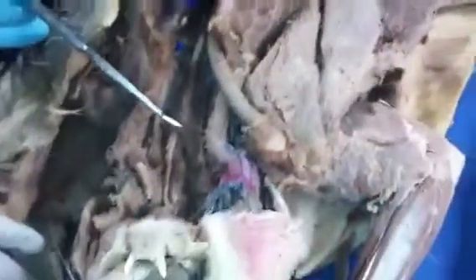I thought this was the parotid. I don't remember. Yeah, this is the parotid. And then the submandibular is this one. Yeah, this is the parotid right here in the back towards the ear. And then the submandibular gland is this one right here that connects at the bottom, kind of in the throat.